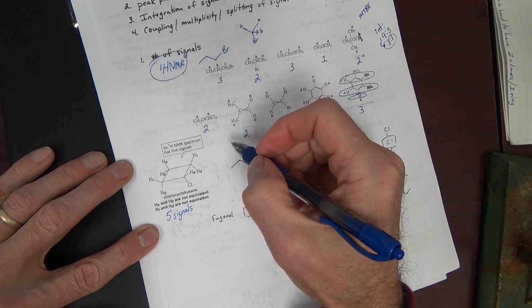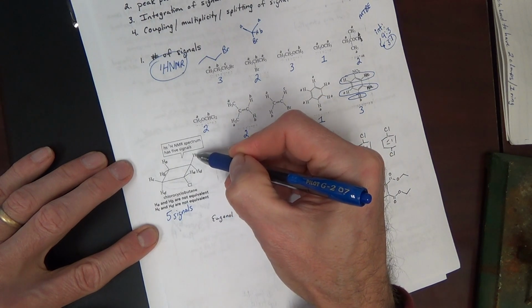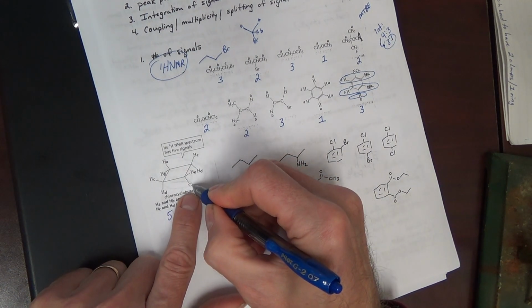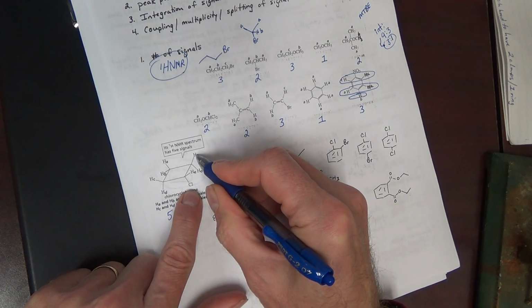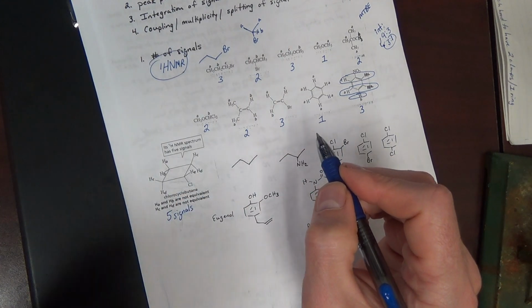What about these two? They're both on the same carbon, but they're not the same, because HD is cis to the chlorine, where HC is trans. They're not the same.